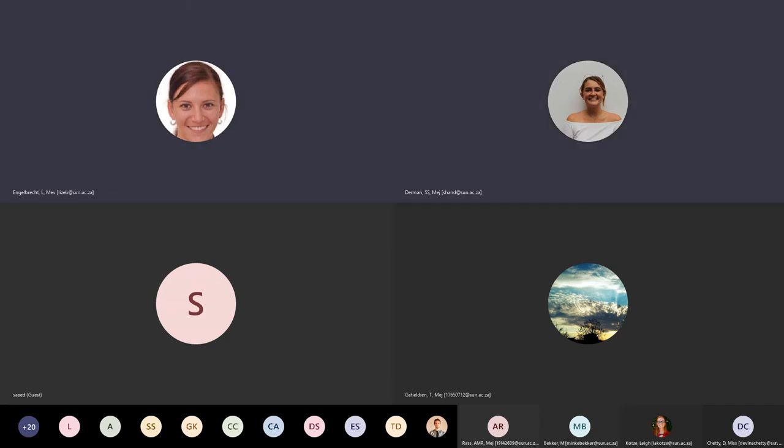Shannon. Yes. Hi, Lisa. This might sound like quite a petty question, but I'm struggling to export any scale bars that I load on the Zen software. I can see it in the software, but when I want to export or save that image, the scale bar disappears. Is this something you could help me with?